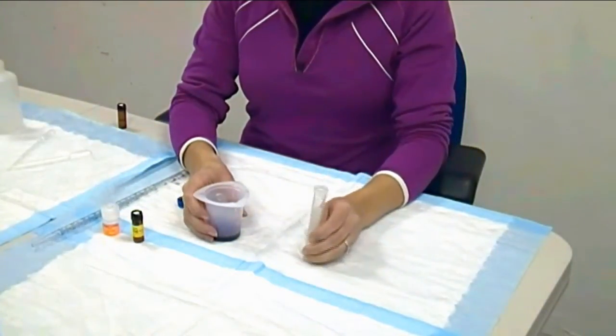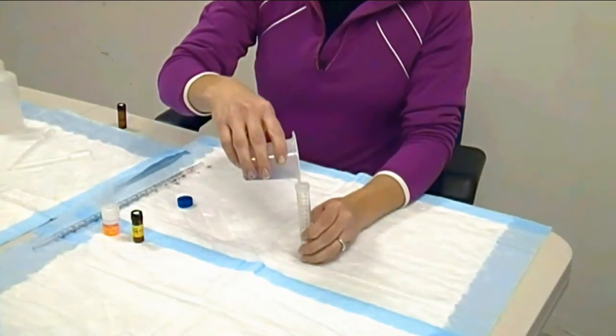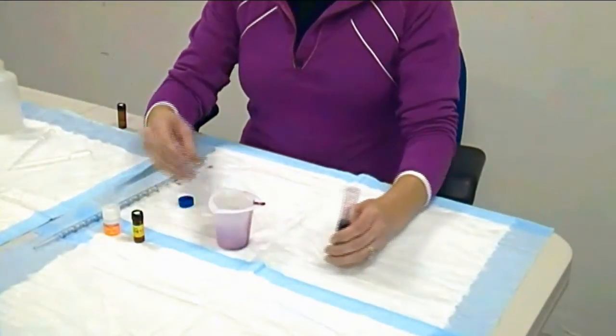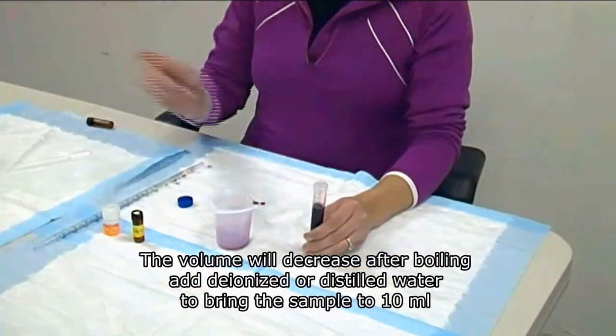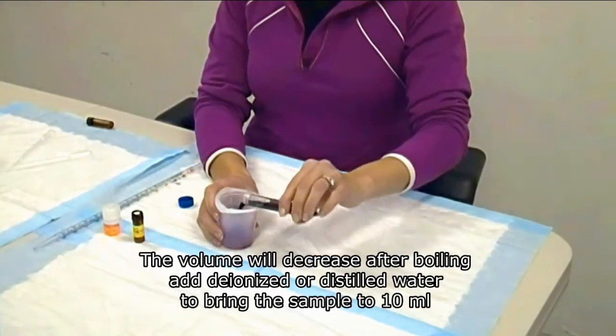Now I'm going to pour the wine sample into my 15 ml conical tube. I want my final volume to be 10 ml, so I bring the final volume up to 10 ml using de-ionized water. Right here is 10 ml. I pour the 10 ml back into the beaker.